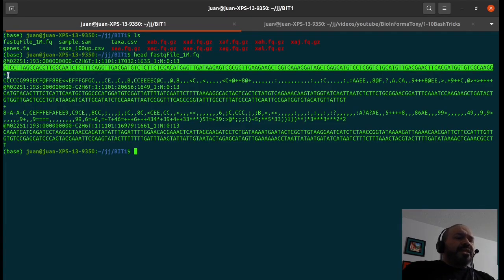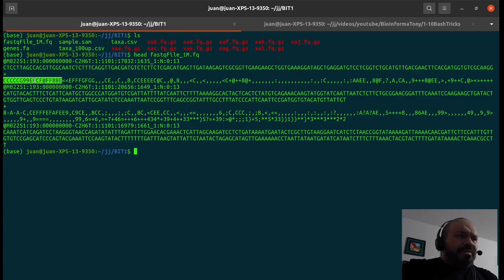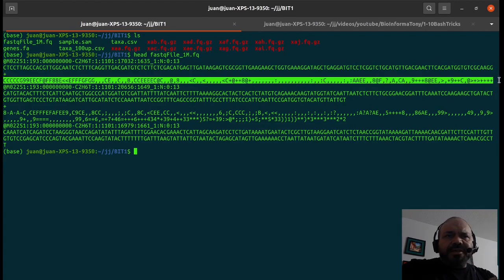The third field, we don't have to mention that. It could be used to include additional information about sequencing, but in this case it's empty. And the fourth field is the quality, the code for the quality of each of the nucleotides or base pairs.